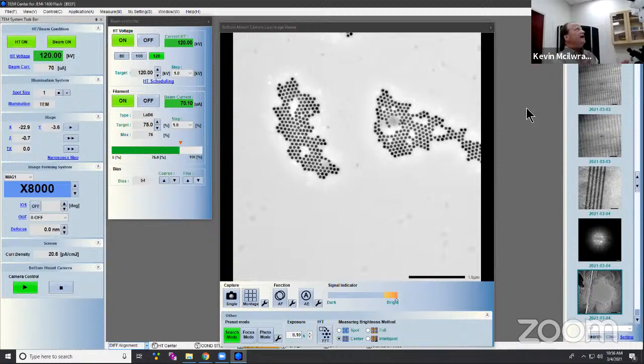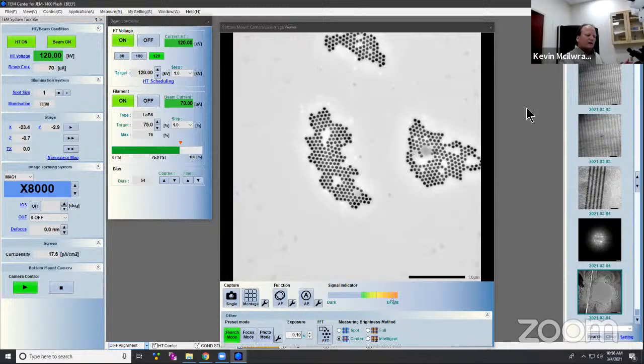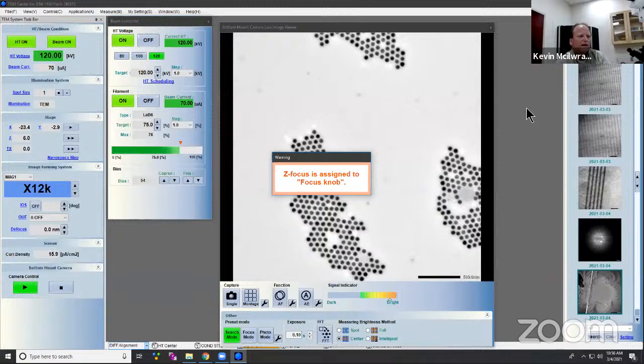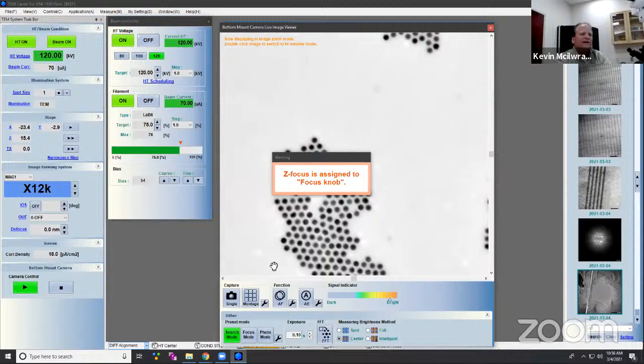That's my condenser aperture. So now I'm going to look at my voltage center. I've got a little button, and I have to put the sample at the right height. I can see that these samples move a little bit, so I'm going to adjust the sample height to bring it to the correct spot. And you can see the diffraction, like right here, these white dots. As I change, that's the crystal diffracting the beam.